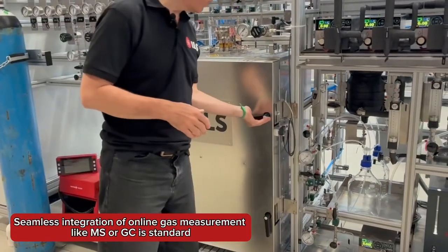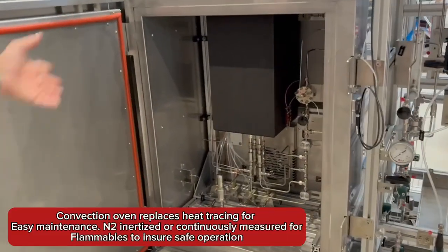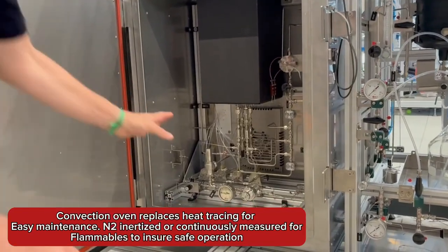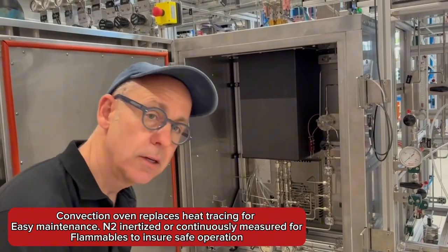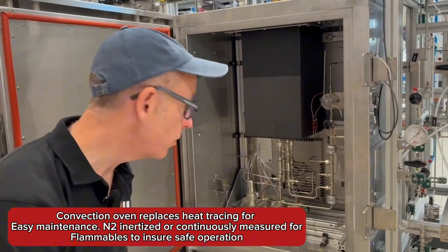As in almost all of our units, we have our custom oven configuration here, which we use to mount all of our downstream components. This gives much easier access and makes maintenance much easier. Leak testing is much easier in units like this. If one of the glass reactors breaks and your catalyst falls down in the tube, it's very easy to access it here, which is not always the case with some of our competitors.